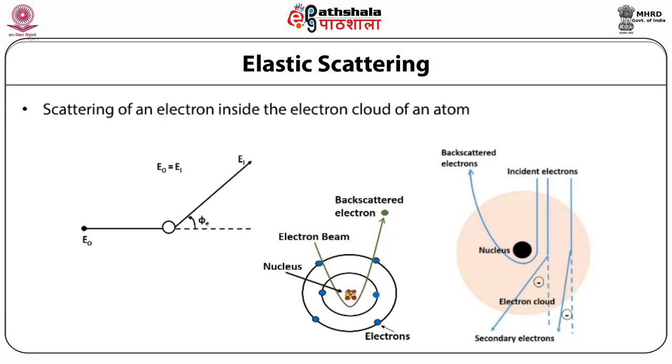If the electron passes through the sample without any interaction, no energy is transferred. Such an electron beam consists of electrons that pass through the sample in the direction of the incident beam without any deviation.